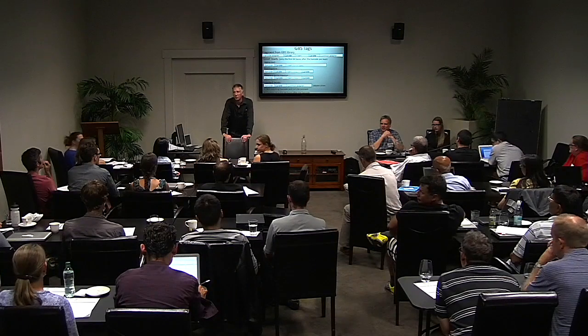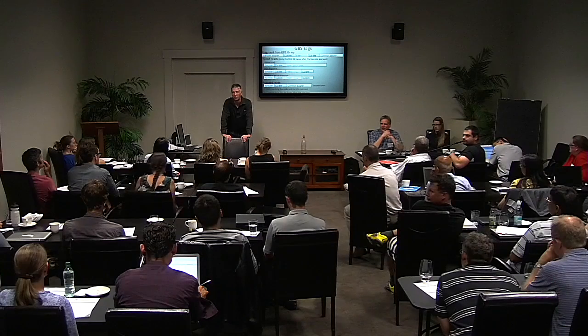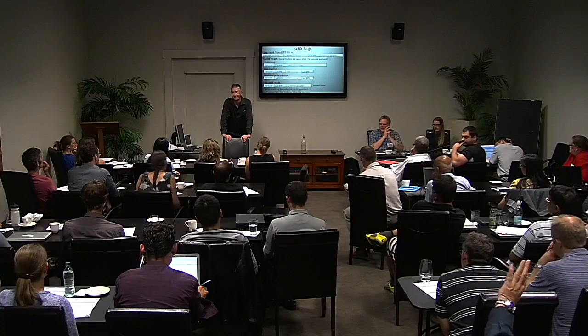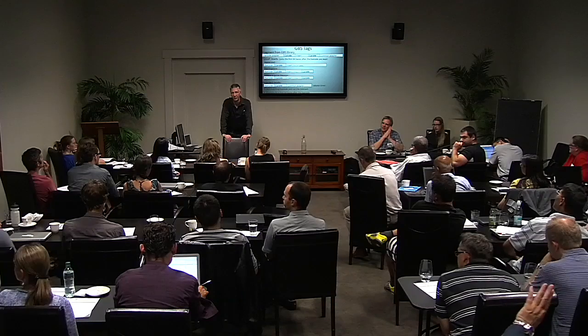So I was just thinking about what Katie said about the error thing. If you're allowing one mismatch in 20, that's actually 5%. So if you're mapping, doing the network filter, and you're taking 20 and allowing one mismatch for that topology, that's actually 5%.